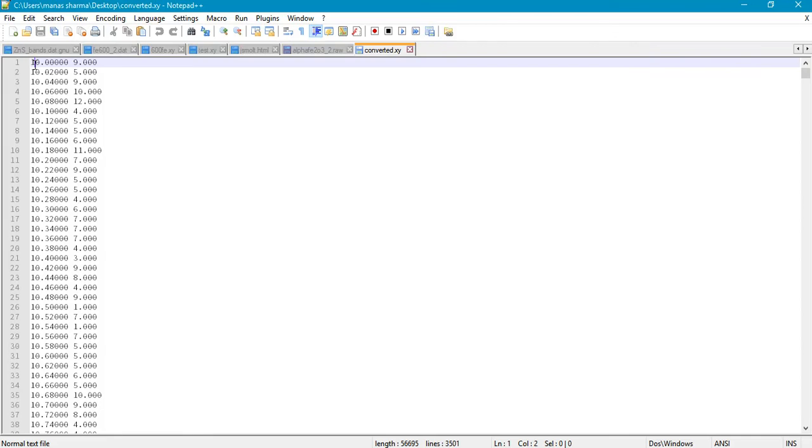Hey guys, how's it going? In this tutorial, I'm going to show you how to plot the powder X-ray diffraction pattern using Origin.